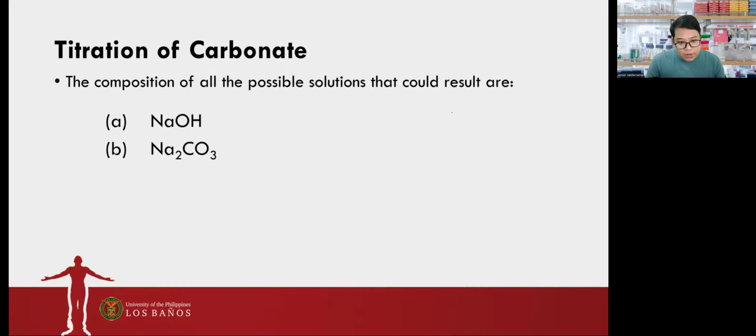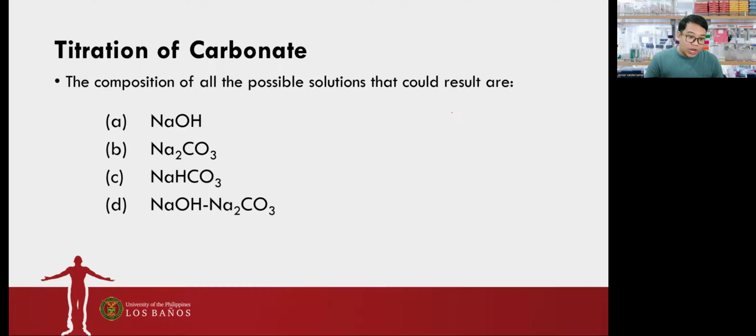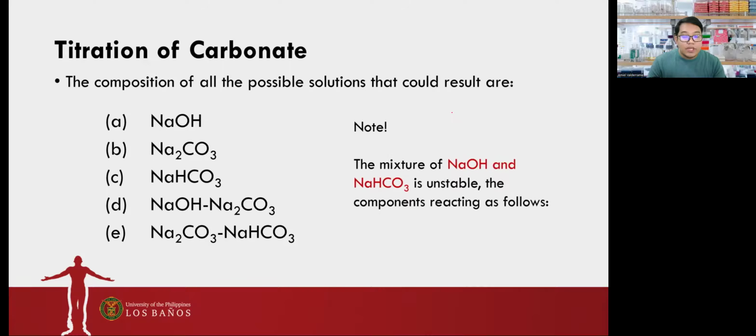So these are the possible compositions of your carbonate mixture. So pwedeng solo lang na sodium hydroxide, pwedeng pure sodium carbonate or pure sodium bicarbonate. Or pwedeng mixture ni sodium carbonate and sodium hydroxide, and sodium carbonate and sodium bicarbonate. Okay? And yung mixture of sodium hydroxide and sodium bicarbonate is not stable because of the following reaction.